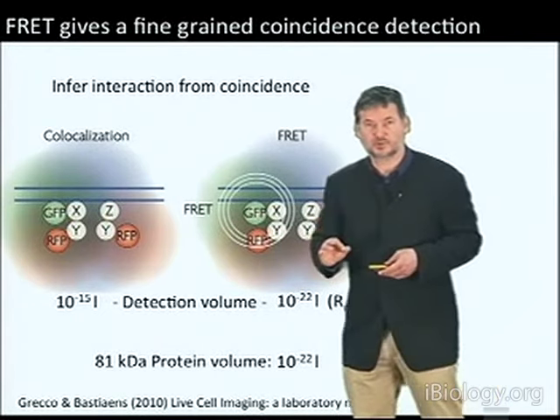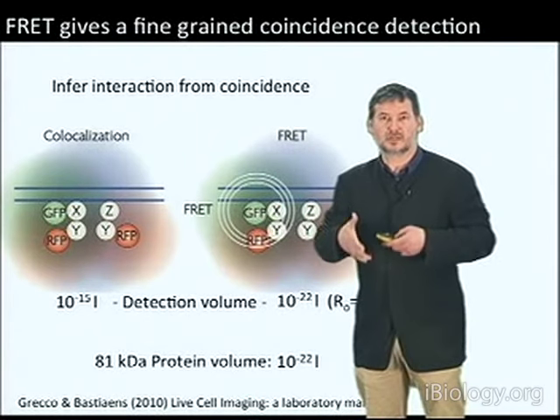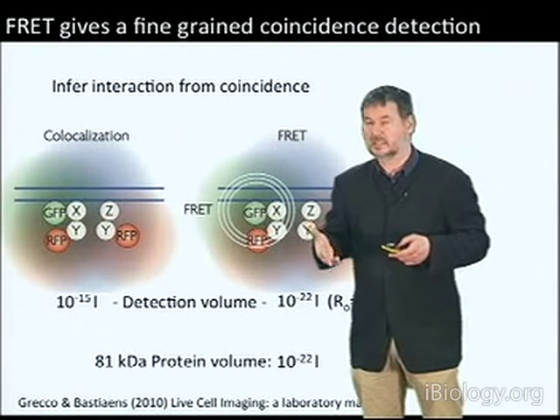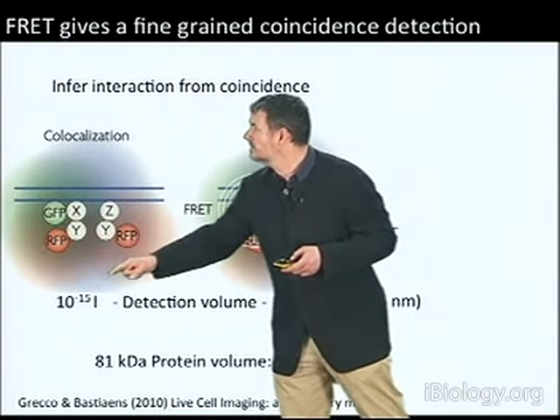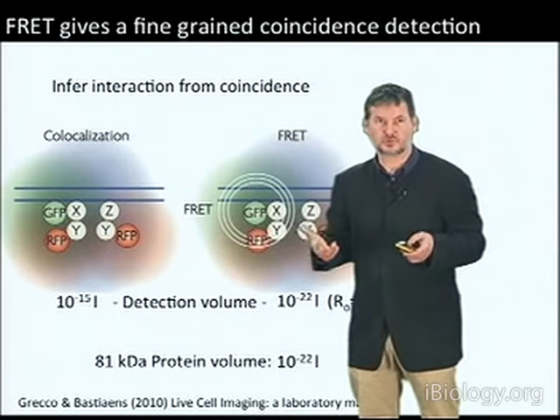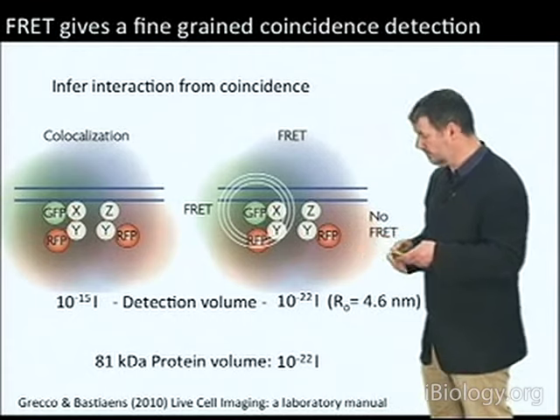Now, an important point to make here: FRET is not a technique to improve resolution. It's not a super resolution technique. It gives you a signal about how many molecules in a volume element are actually interacting. It's proportional to the amount of molecules that are interacting. That's an important point to make. So, no increase of resolution.